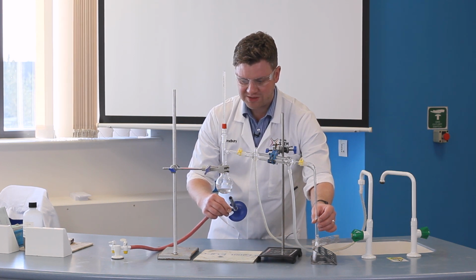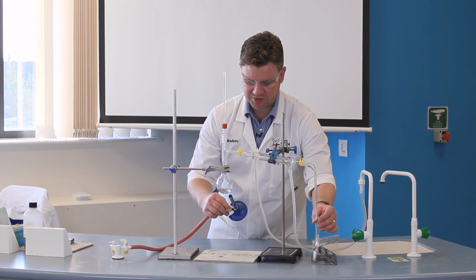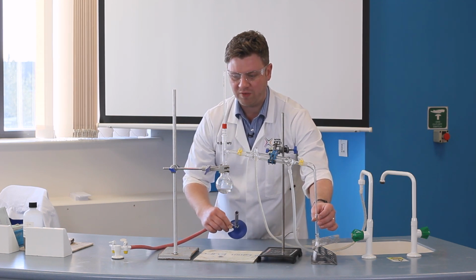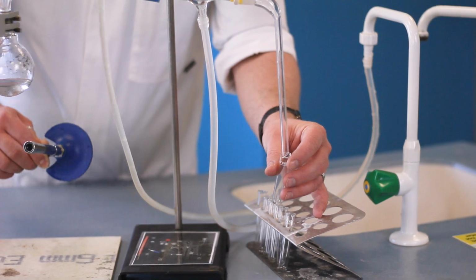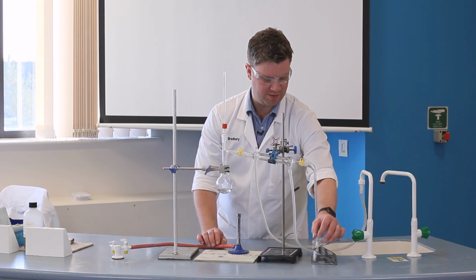And what we can see here is that all the time I'm conducting this demonstration, because I'm trying to keep my eye on what's going on in the round bottom flask to make sure I don't overheat it, I'm trying to keep my eye on the thermometer to check that I'm only getting one fraction coming off, and I'm trying to collect the fraction at the same time.